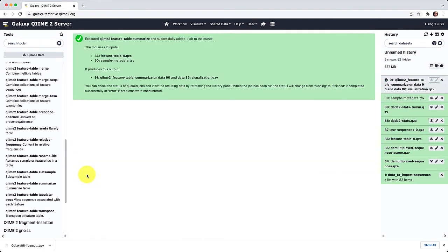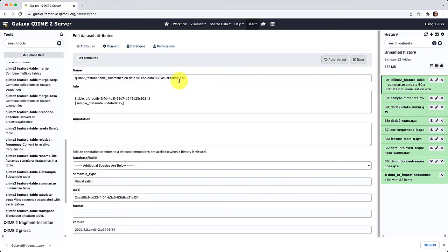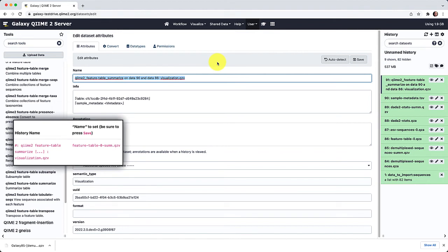We'll pause the video while this runs. Now that our visualization has turned green and is done running, let's rename it to help keep track of everything. We're going to call it feature-table-zero-summary, and since it's a visualization we'll append .QZV. Finally, we'll click Save.